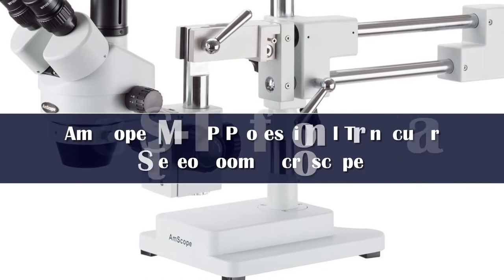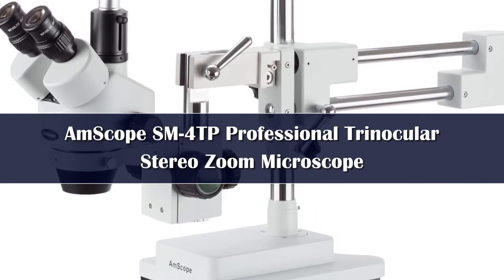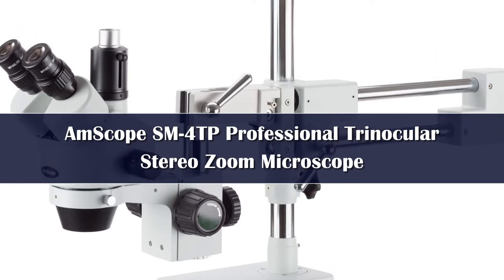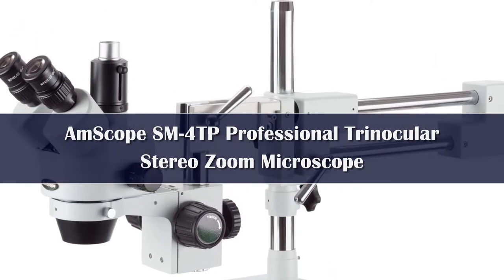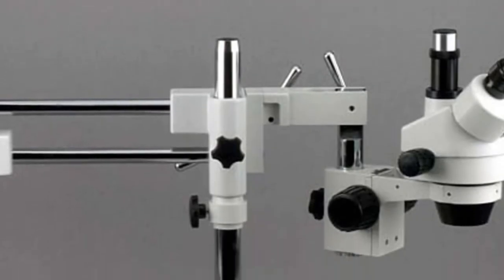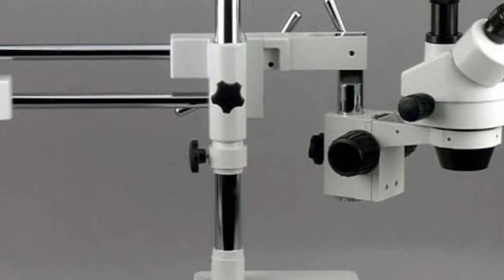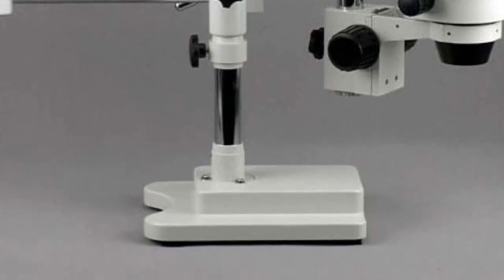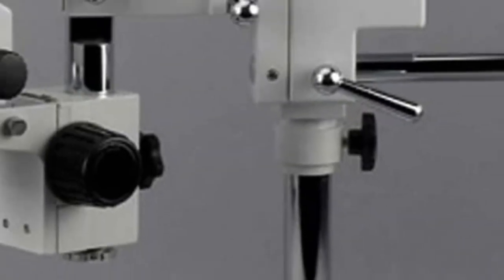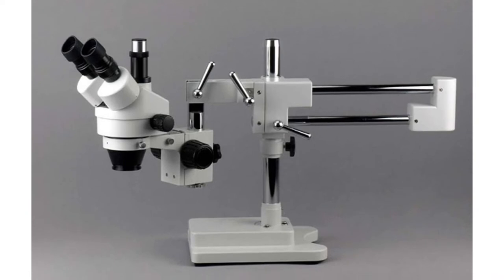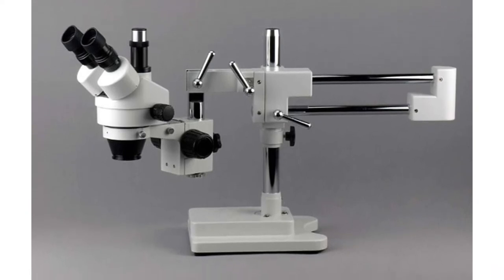Number 3. Stereo zoom microscopes are highly capable and allow you to focus on your subjects more easily. Rather than having to spend so much time adjusting the magnification, you can simply calibrate the zoom setting and get to the right level immediately. This model from Amscope is highly flexible and versatile, making it ideal for professional or personal use. When comparing models, trinocular stereo microscopes offer a distinct advantage. Not only can you look through the eyepiece, but you can also set up a camera to look through the third lens.